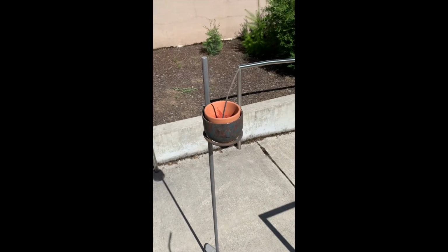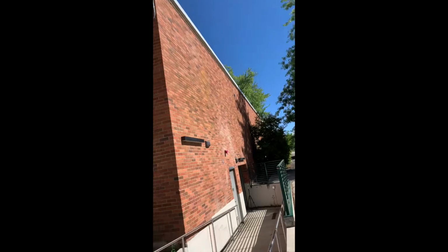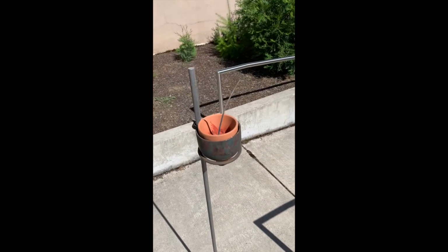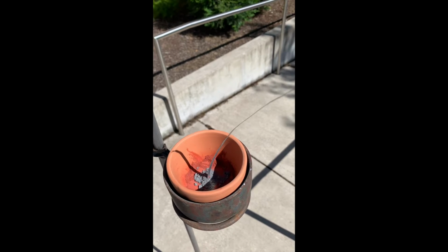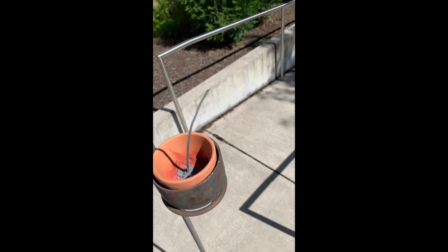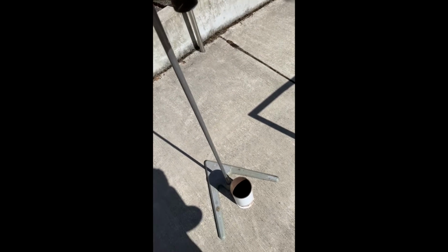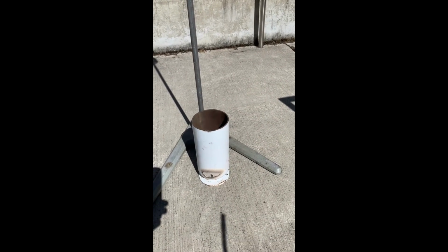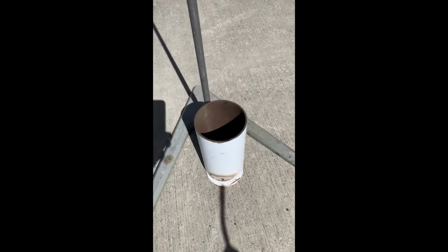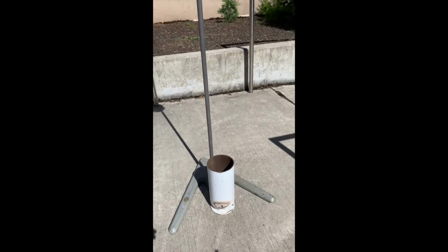Okay, here we are outside of Columbia Hall. Beautiful day. And here's our flower pot with the thermite mixture, the thermite starter, and the magnesium fuse on it. It will be running down into the steel container that has sand on the inside of it in order to catch the molten metal.